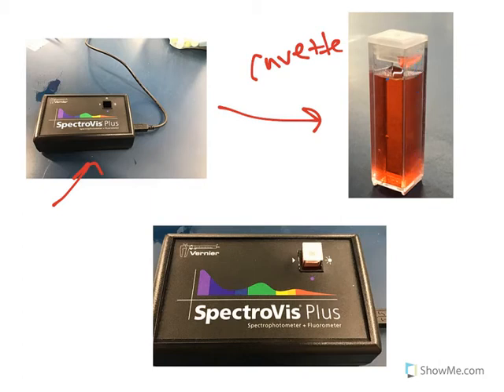It's important that you line the cuvette up the correct way into the spectrophotometer. So down here on this spectrophotometer you can see this white arrow. That's the direction of the light as the machine shines the light through. You want that light to go through this smooth side, that way there's no accidental absorbance.